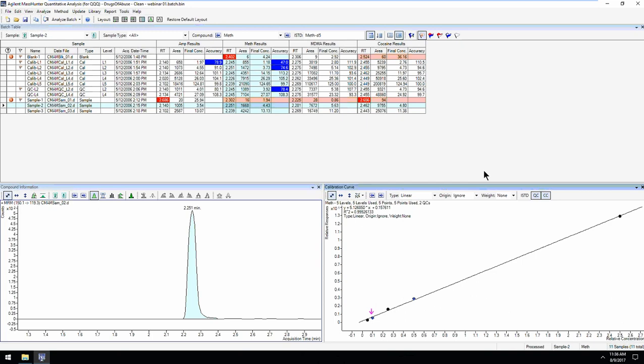Okay. Can you please give some examples of how custom calculations can be used with reports and/or the table export? Okay. Custom calculations are going to require some additional information, a little bit beyond the scope of where we are in this particular lecture. If we're going to write a custom calculation, we're going to need to designate that calculation, and generally speaking, these are in Python code.